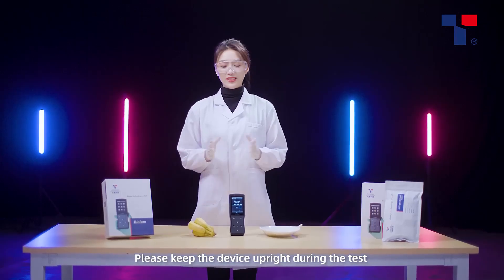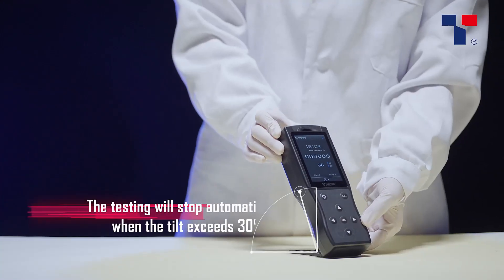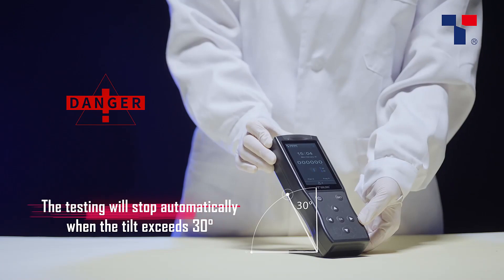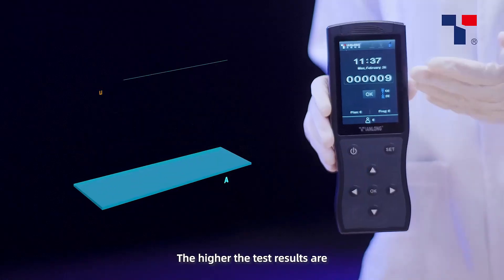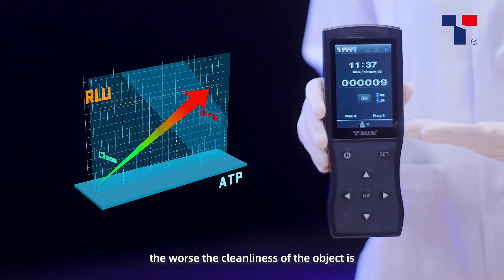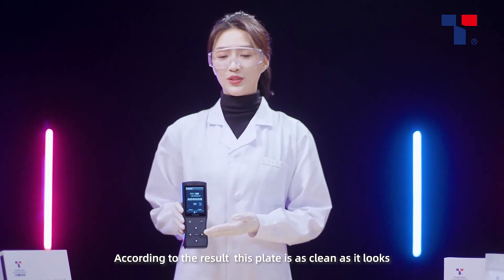Please keep the device upright during the test — if not, you will hear an alarm. After 10 seconds, we can see the test results. The higher the test results are, the worse the cleanliness of the object is. According to the result, this plate is as clean as it looks.